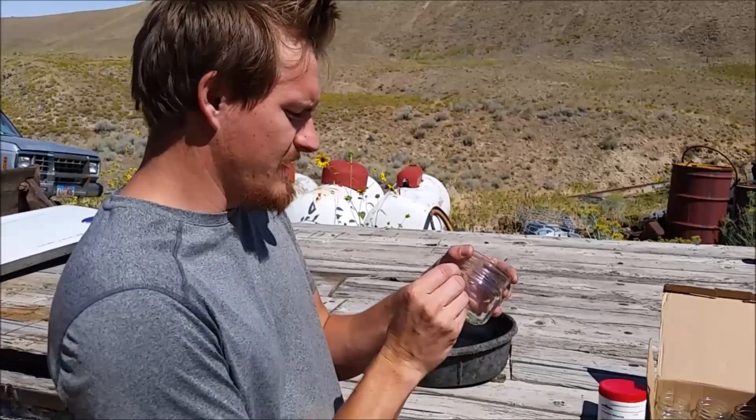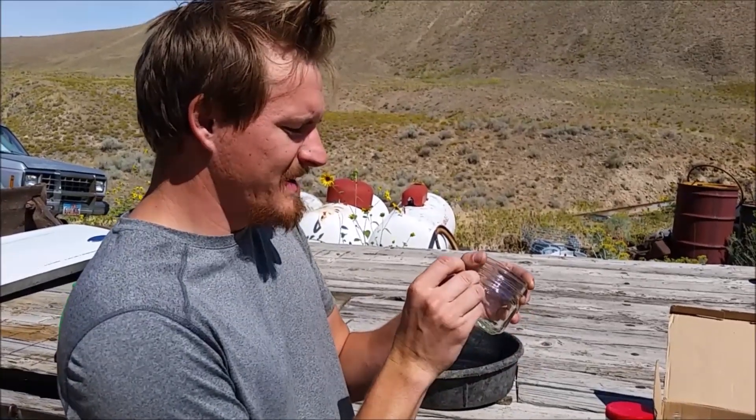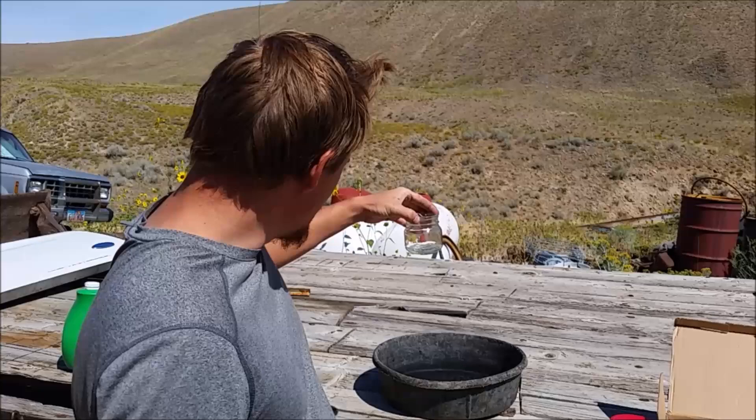I'm just going to draw in here with some beeswax — draw 'Cody's Lab' or something — and then we're going to go ahead and put it in a solution of this, let it sit in there for a couple hours, wash it all off, and then see if we got it etched.